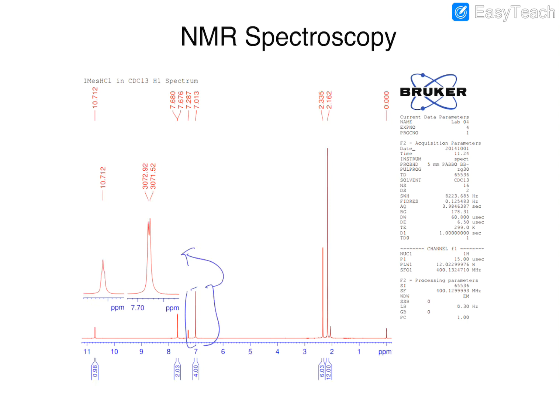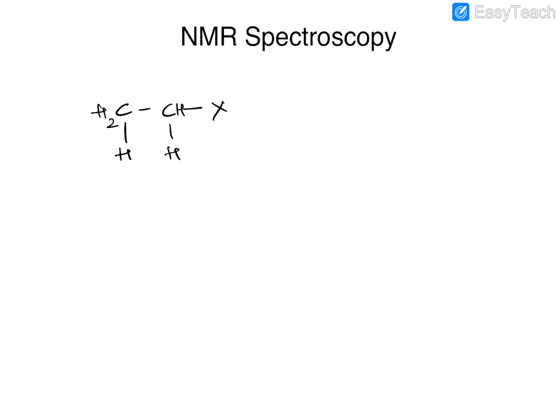Therefore, in any normal NMR spectrum recorded at quite a higher field strength, you would see that all these coupling patterns are given only as an expanded form, because the spectrum itself is well resolved due to it being operated at higher field strengths.